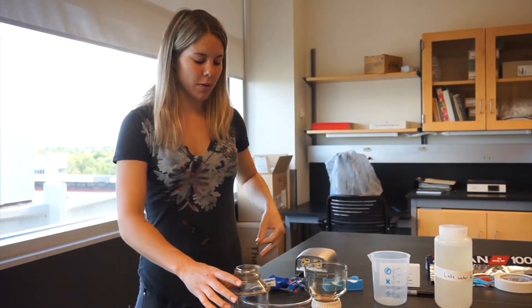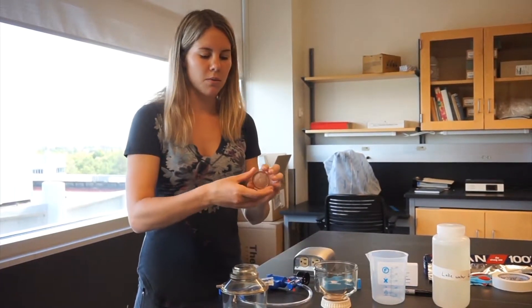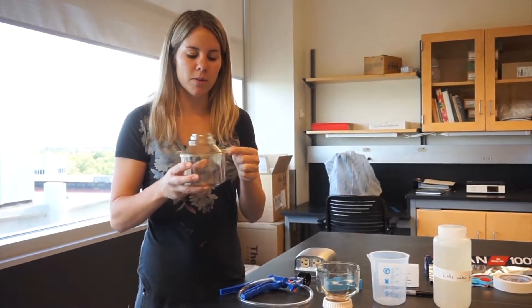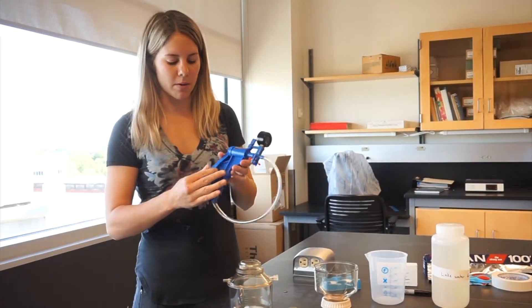You'll start by setting up the filtering apparatus. You have the upper funnel, the middle piece that's the filter holder, and then the bottom receiver flask. Make sure that there's a stopper on the one side spout, and then you can attach your blue hand pump to the other side spout.